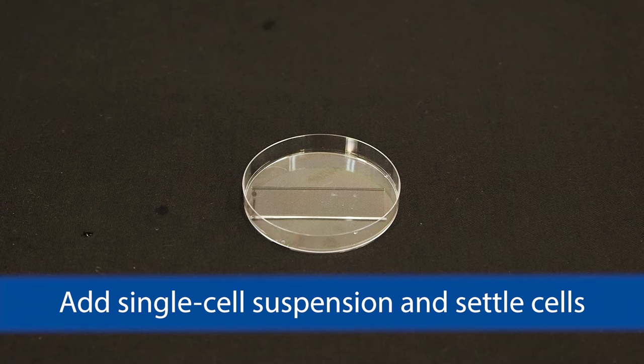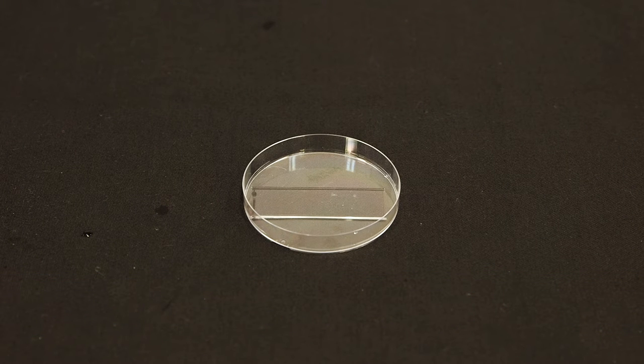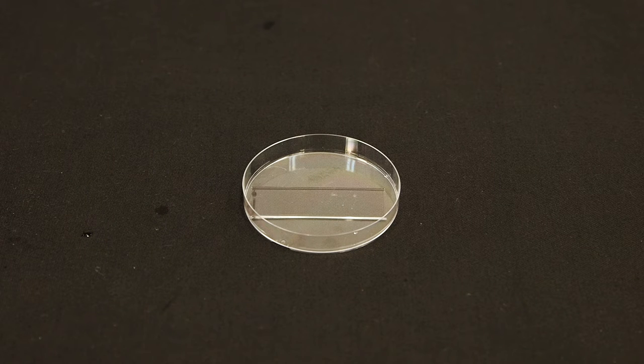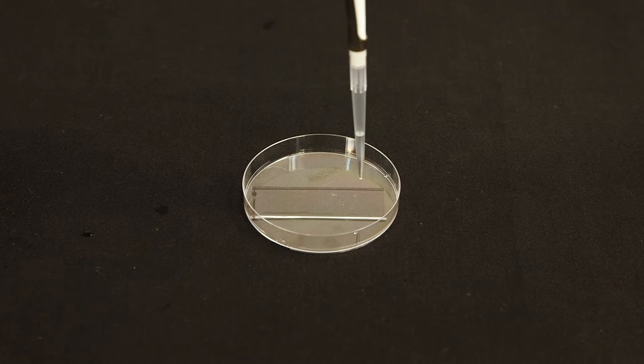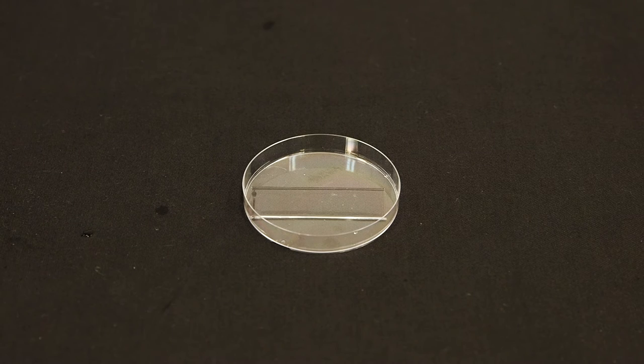After you have prepared your single cell suspension of 10,000 to 100,000 cells in a total volume of 1 milliliter, pipette it directly onto the surface of the gel using a back-and-forth motion to ensure that the chip is evenly covered.